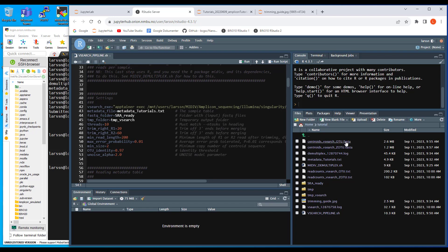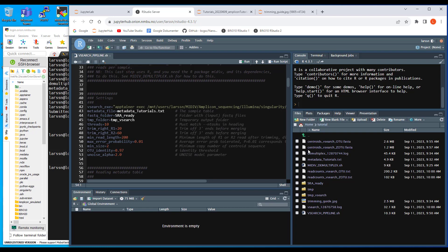And that may be strange. If this is sort of zero radius OTU's, shouldn't there be more of them? Well, yes in principle, but keep in mind that this unoise procedure has a very very strict requirement. For this here it's not really something you can tune at all. It says that you have to have eight copies to be a centroid.